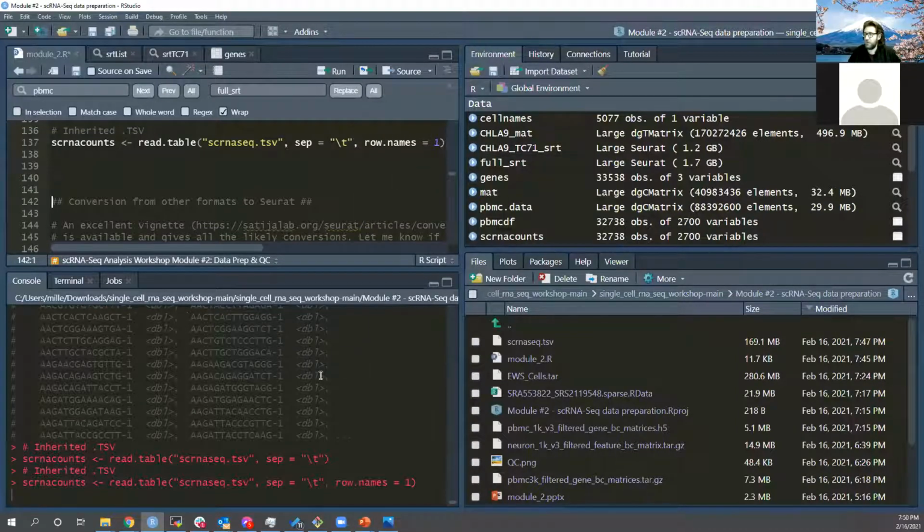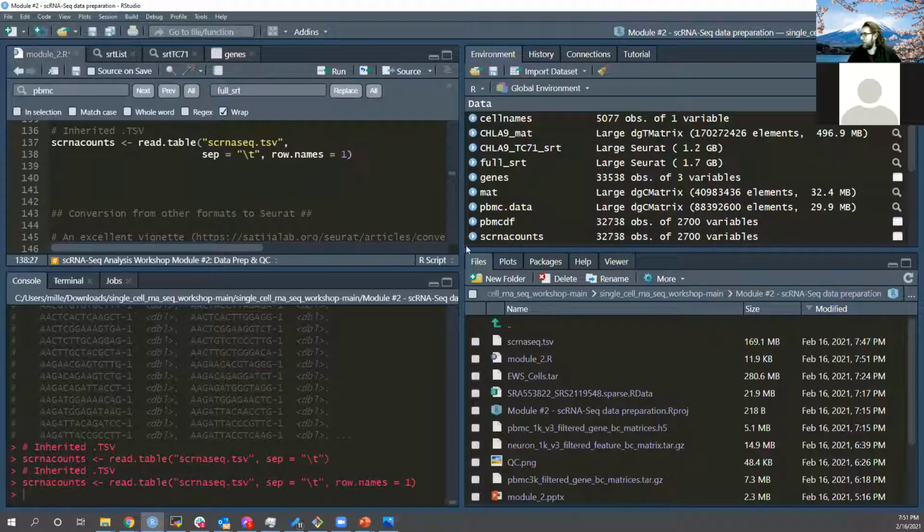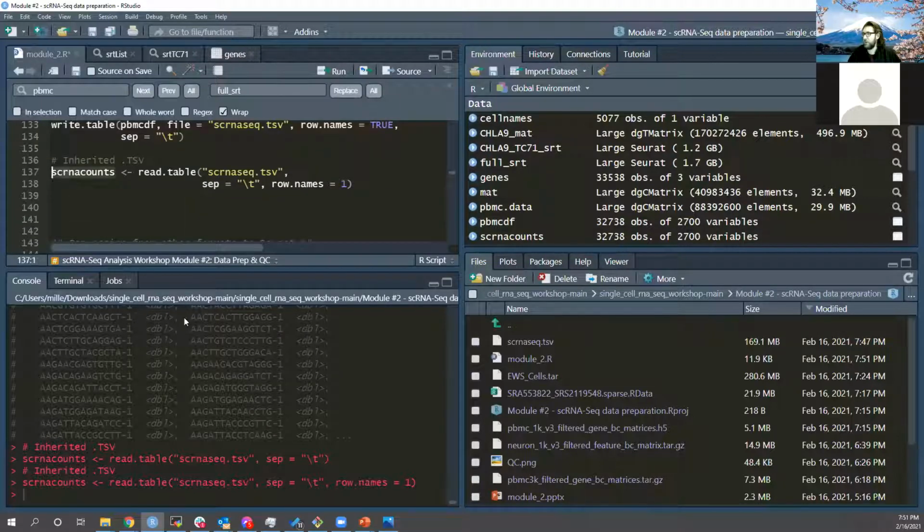So what is that doing? Well, that's basically saying the first column is the row names. So when you build the data frame by reading this in, set the first column as the row names. All right, now it's done. I would really recommend not printing what I just made to the screen, because that can end up making R very unhappy, because it's a data frame, not a tibble.